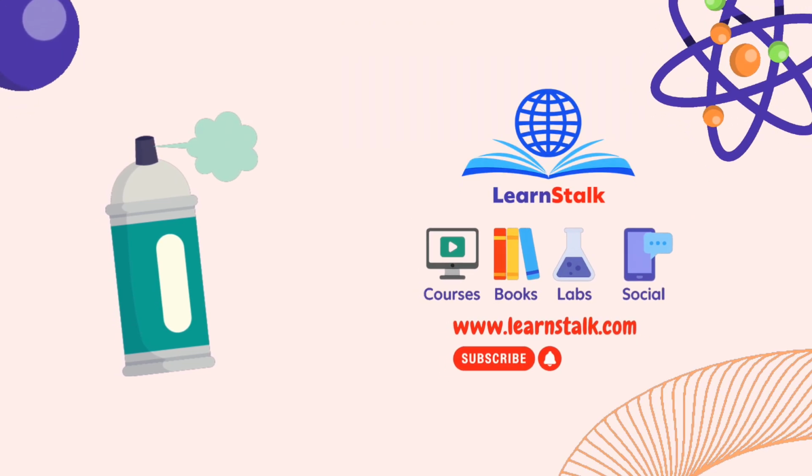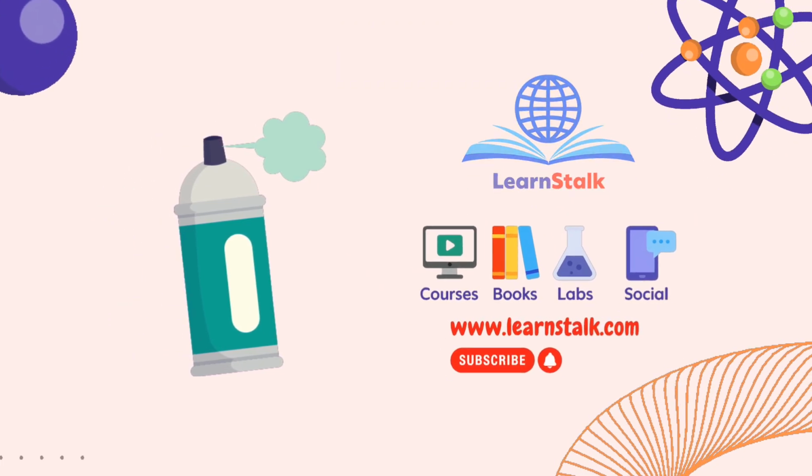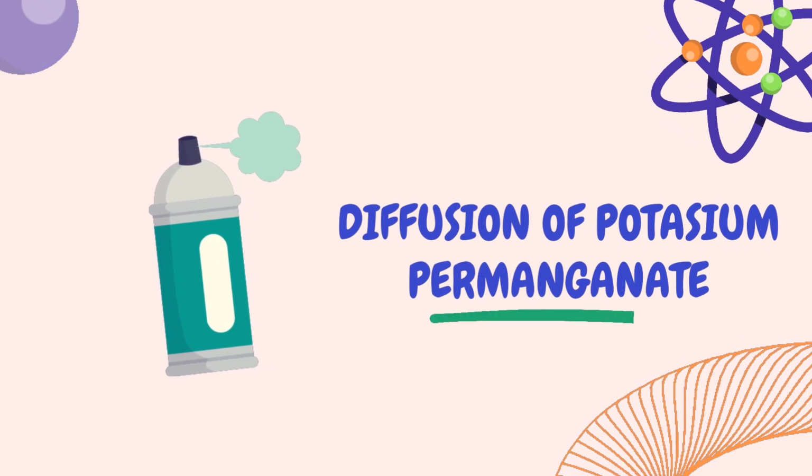Ever wondered why the smell of perfume spreads across a room, or why ink swirls in water like magic? Stick around as we cover diffusion of potassium permanganate to demonstrate how particles travel in a liquid medium.